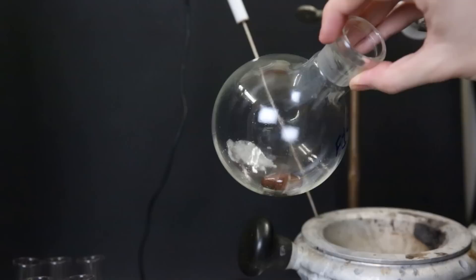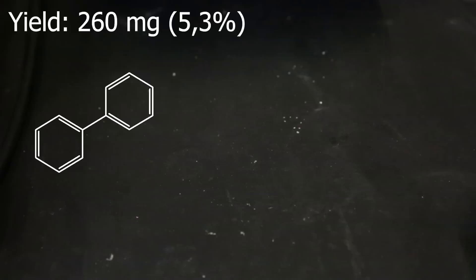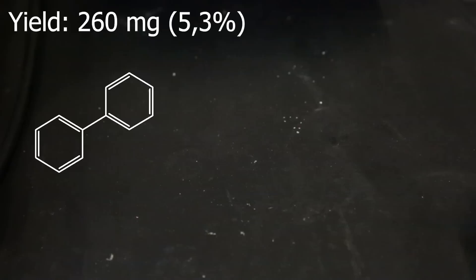After pretty much all of the solvent had been boiled off, I am left with a white solid at the bottom. I scraped off some of it, and dissolved the remaining bit in ether, and poured it into a crystallizing dish, and started boiling off all of the ether. When all of the ether is gone, the solid crystallizes out, which I scraped off and combined with the stuff from before. I put it all into a weighing boat, and the yield turned out to be 260 mg, which is 5.3%.